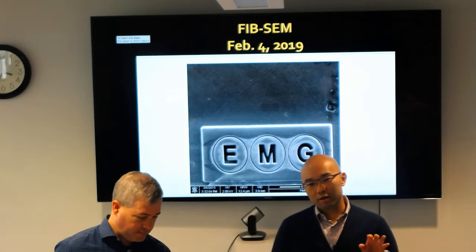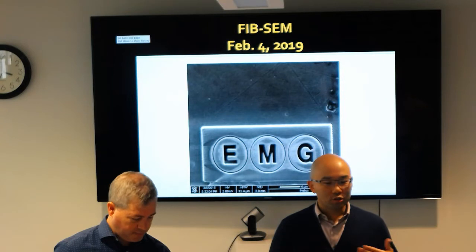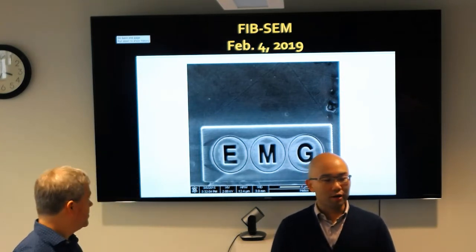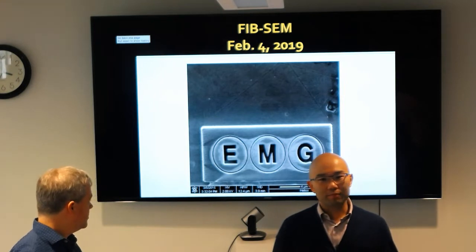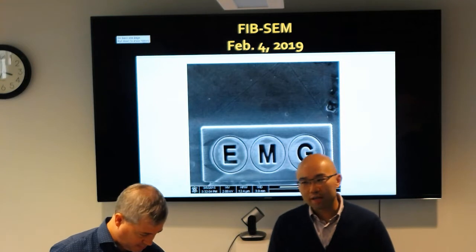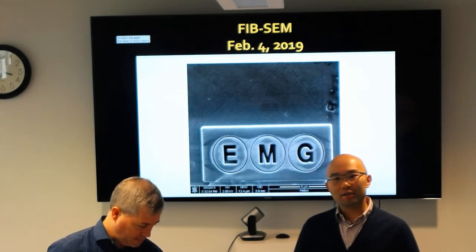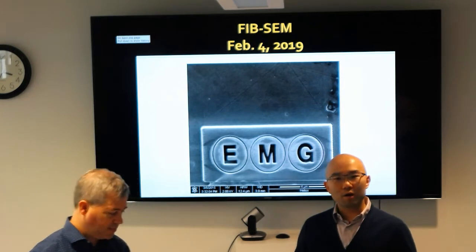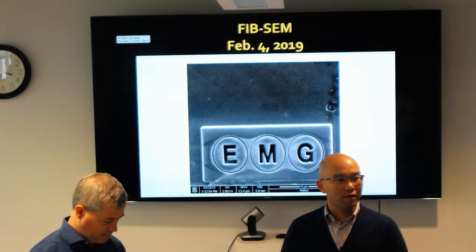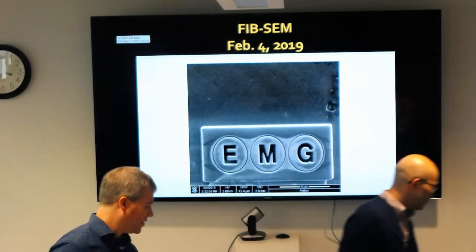A particular function of the scanning electron microscope is that you can have a focused ion beam with it to look at volumes. The whole purpose, for tomography, is that we want to look at volumes, whether by tilting the sample or doing what we're doing here. You'll hear a lot about that from our lecturer today, Bill Rice. He's our EM manager, and he's tasked with a lot of things. He leads a lot of our tomography applications, more so in the cryo field, and that's a specialty unto itself. You'll learn a lot about that today. So, Bill Rice. Thanks, Ed.